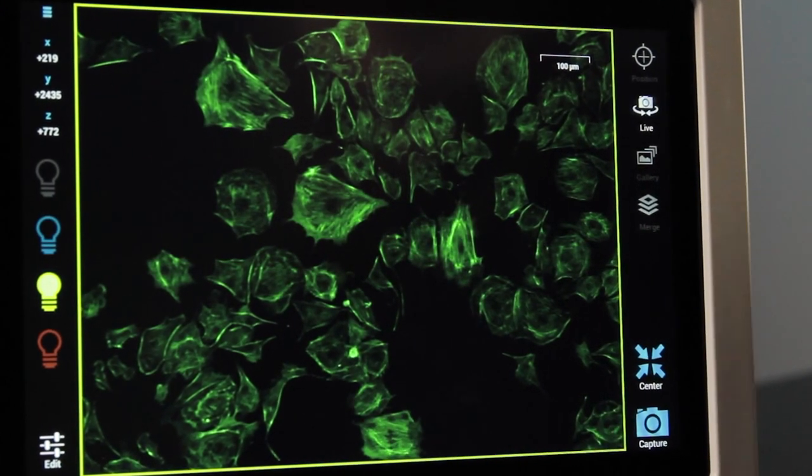Image cells in tissue culture dishes, flasks, or on a slide. Move Zoey's stage and change magnification with a simple swipe on the touch screen.